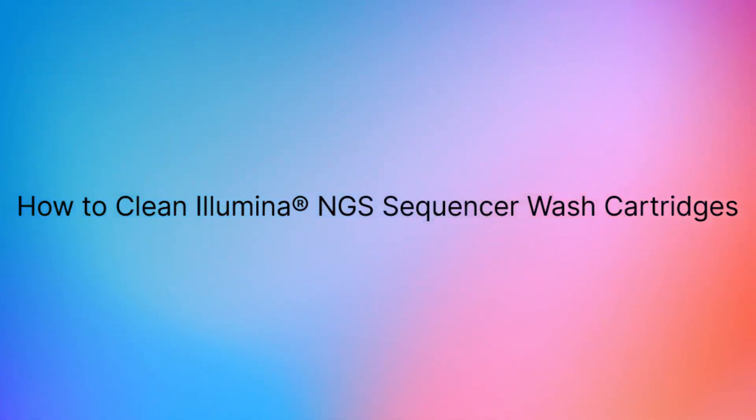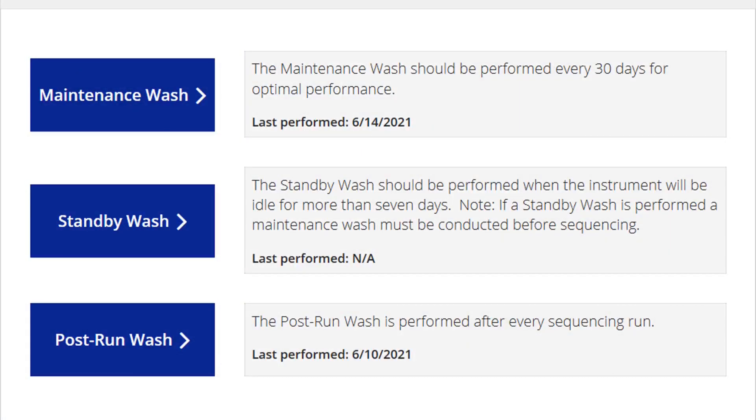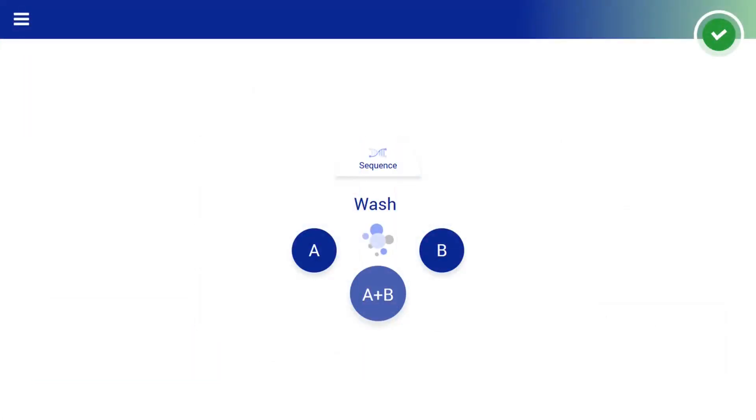How to clean the wash cartridge for Illumina NGS sequencers. Illumina platforms require a post-run wash and/or maintenance wash. To avoid possible contamination during these washes, it is recommended to clean the cartridges regularly.